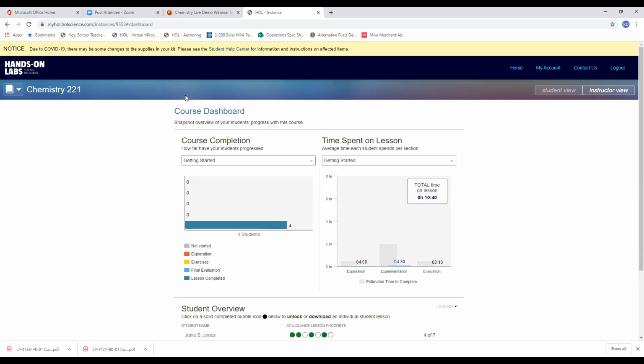So as far as titrations go, more often than not, we're using titrations with a syringe, a large syringe, and a titration adapter at the bottom of it. I don't think one of the sample labs I have up on my screen today shows that, but we have numerous titration labs within our library, and we're happy to share any of those procedures with you after this webinar today.